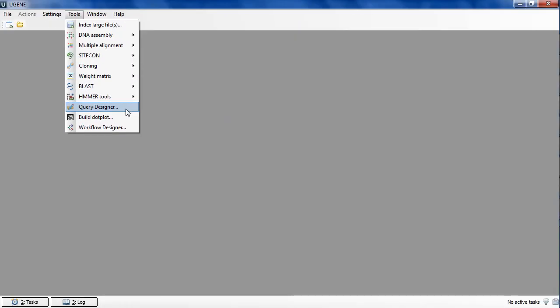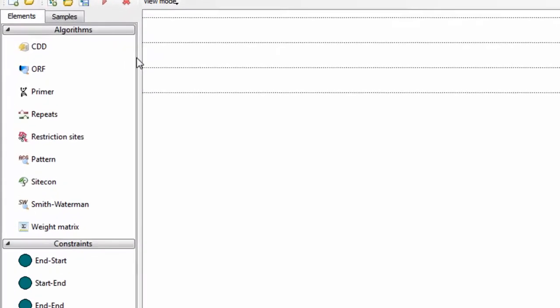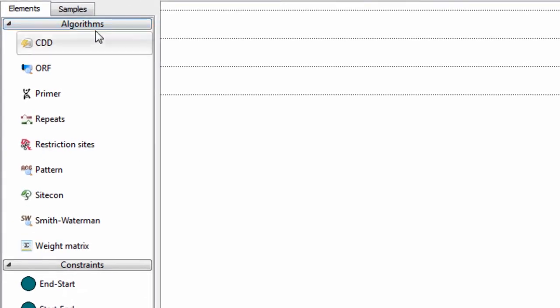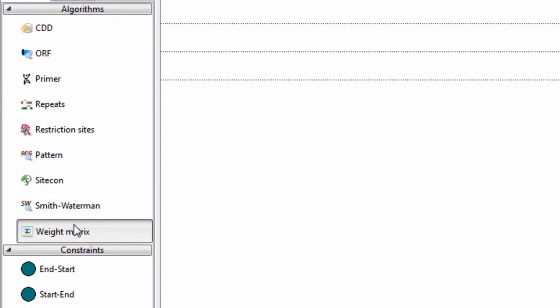Another big innovation of this release is UGENE Query Designer. The Query Designer plugin allows you to analyze a nucleotide sequence using different algorithms: Repeat Finder, ORF Finder, weight matrix matching, etc.